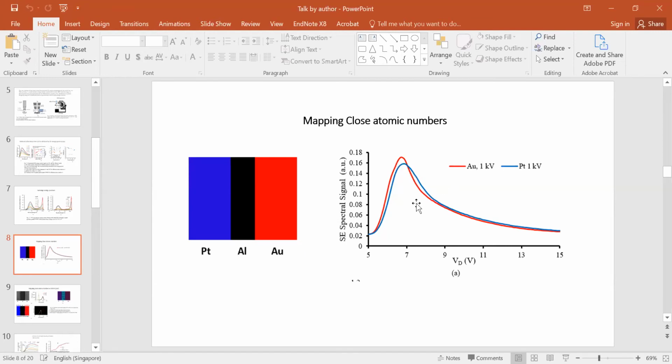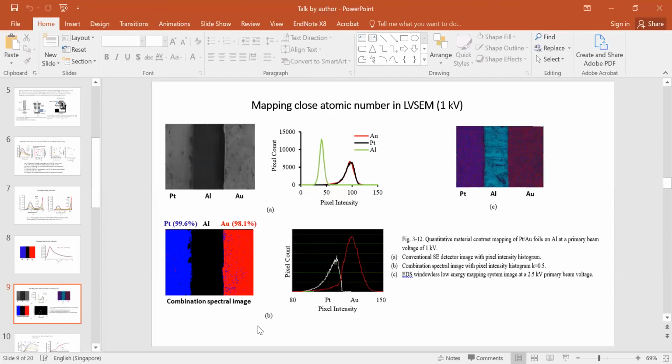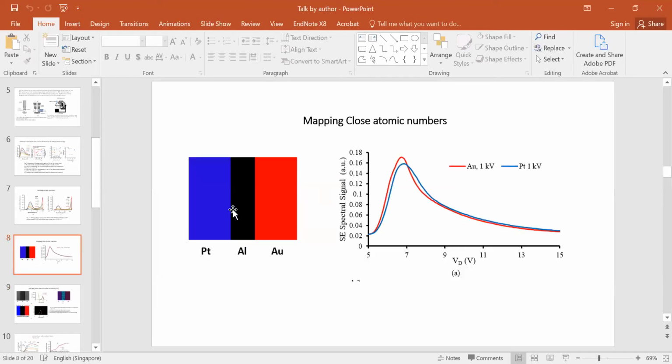And if you use that information together and convert it into a kind of intensity, you can actually use it to map close atomic number materials. Here's platinum. So this specimen that we used has platinum, aluminum, and gold.